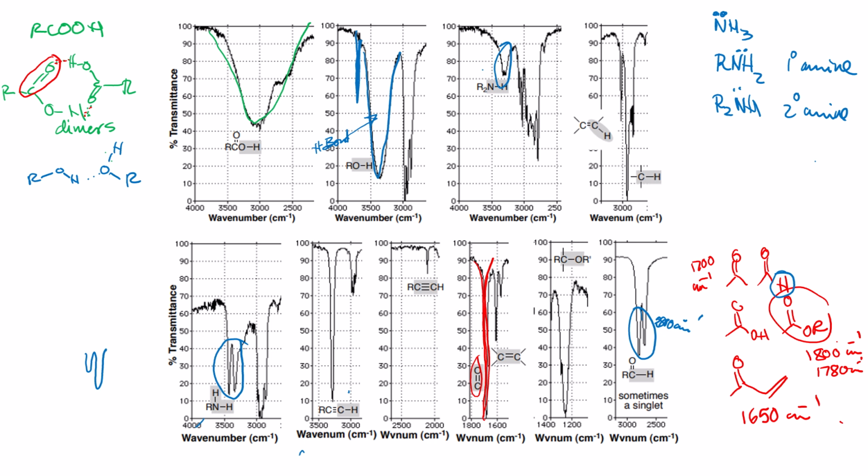If you have a tertiary amine, replacing the three H's in ammonia by carbon groups, now you don't have an N-H bond, so that tertiary amine will not absorb in that region. Also quaternary ammonium salts. So here we have it. Now the bonds to carbon also have characteristic absorptions.